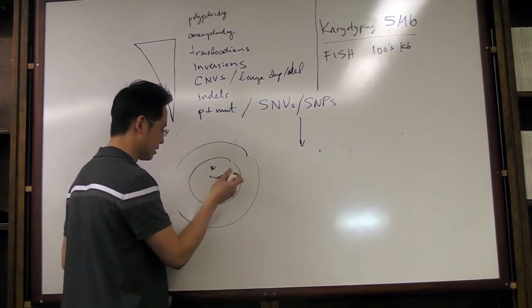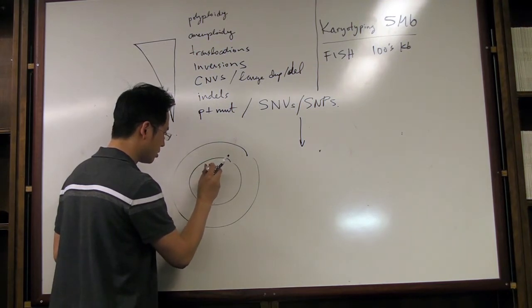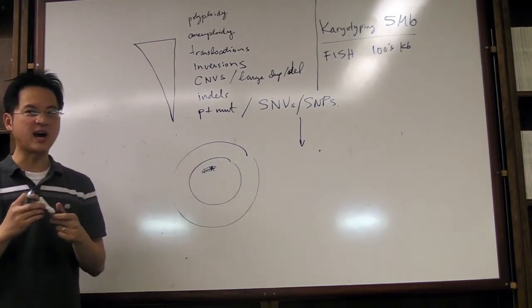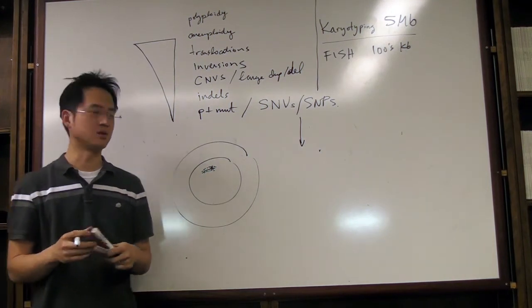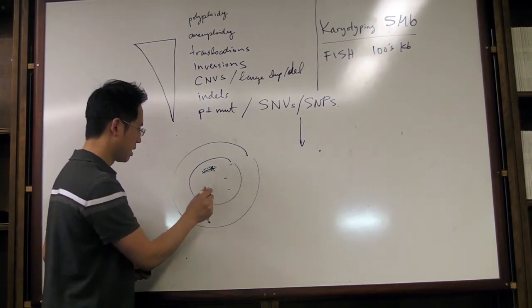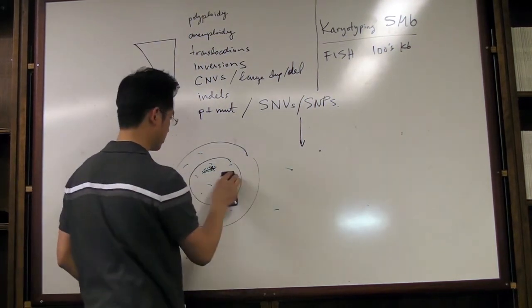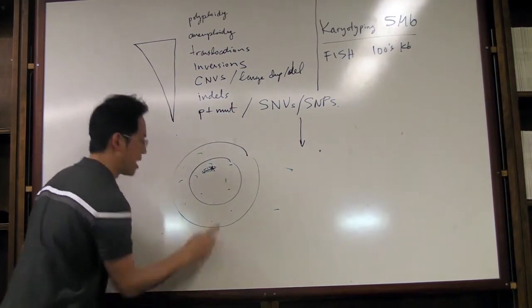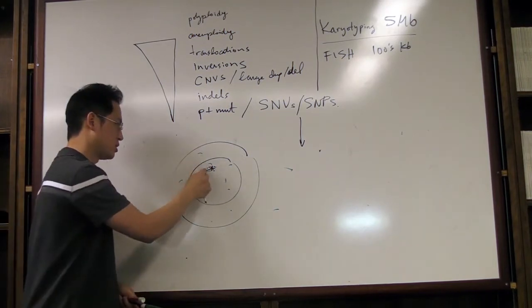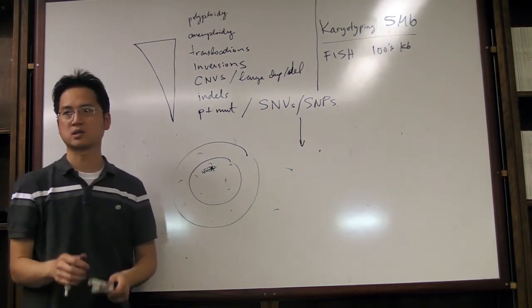But if you have 1,000, so let's just say the target is actually this long here, and you just bombard it end to end on both strands, right? Both strands when you're melting it off with this. The collection of, say, thousands of probes, tens of thousands, 100,000, all together will shine pretty brightly. Yes, you're going to get some off-target binding in the nucleus, in the cell, and in the outside. Hopefully during washing, you're able to get rid of most of them. In the end, they don't amount to much. They give you a sheen of green, but overall, you won't see a collective signal that will be true. So when you look at it, you'll see a very true signal that's just spot on, very punctate signal, round, and that'll suggest that's where your target is.